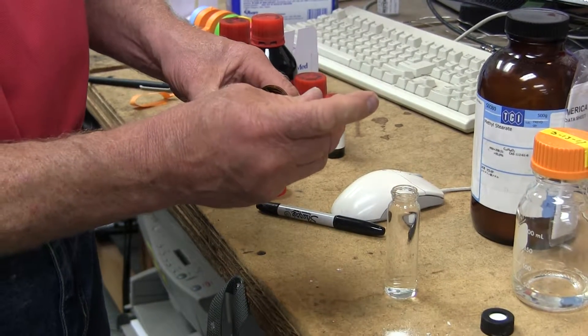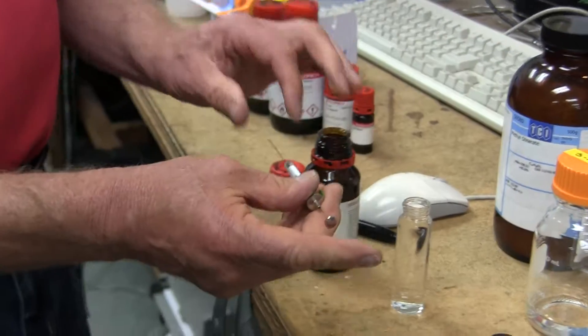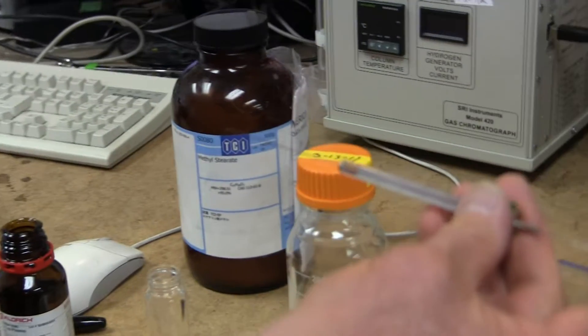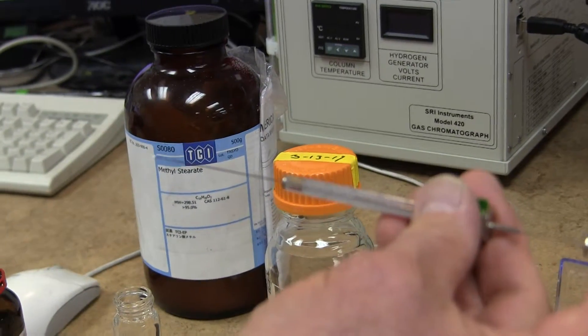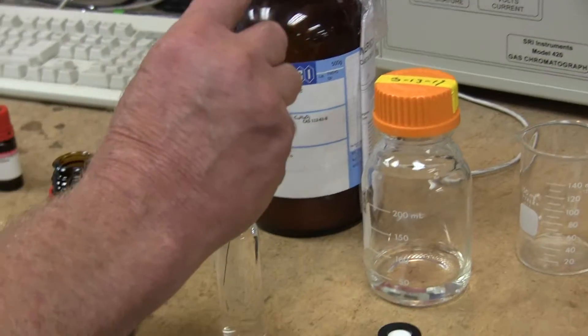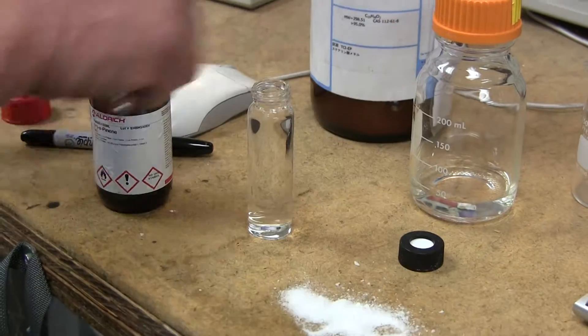These terpenes are a little more viscous, so you have to operate the syringe a little slower to avoid bubbles. But eventually you get four microliters of the alpha pinene in your syringe, and then you put it into the 40 milliliters of internal standard solution.